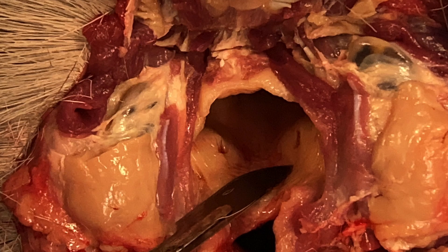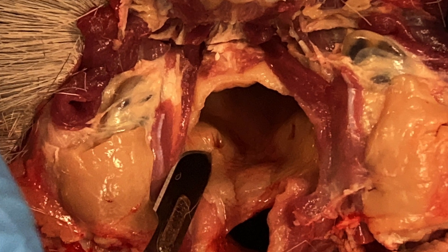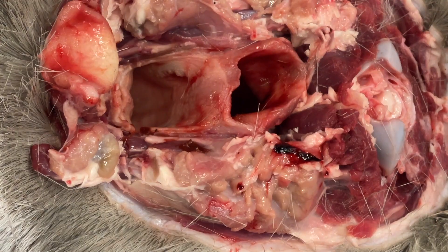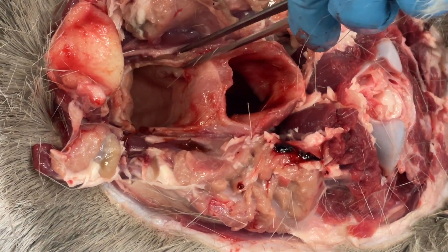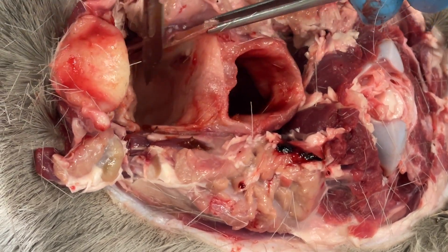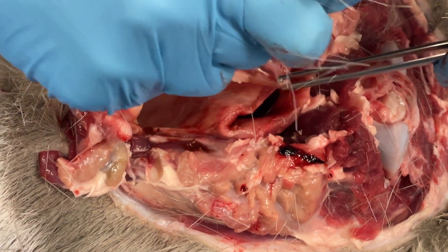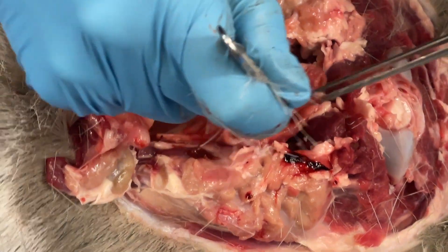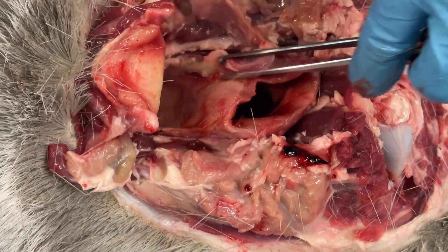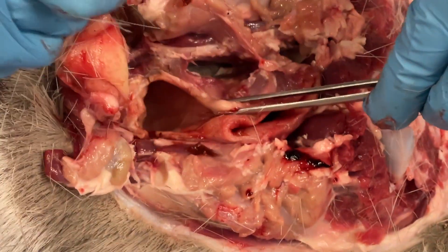Here is a close-up of what each of the tonsillar crypts look like. Using forceps or pliers, grab the tonsillar crypt and cut down to the side revealing the tonsil just behind. The tissue can be difficult to differentiate — it is often pale in color, shiny, and segmented if examined closely. Make sure to take your time as it is easy to cut into the tonsil and leave parts behind.